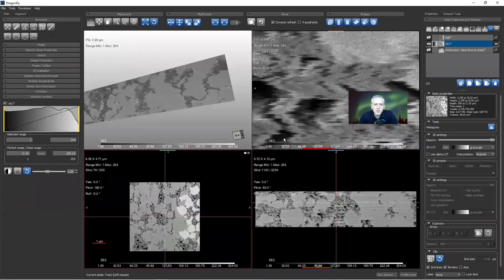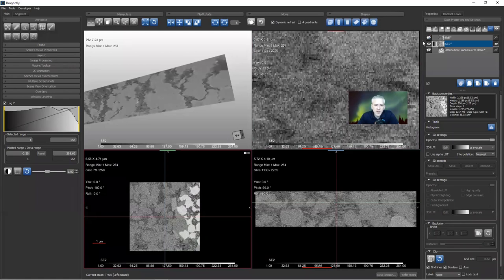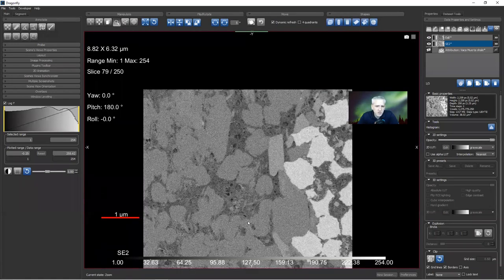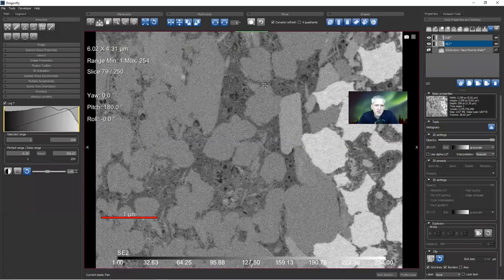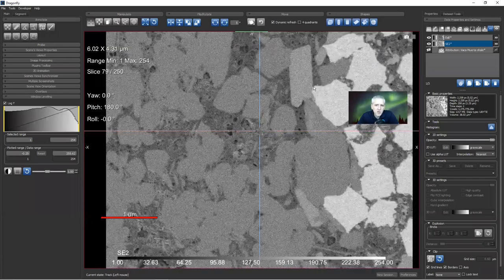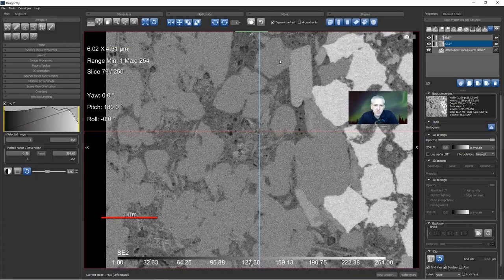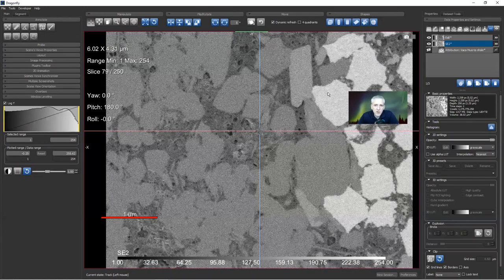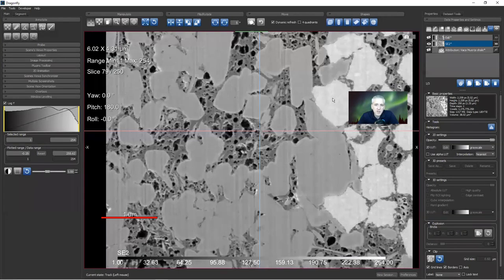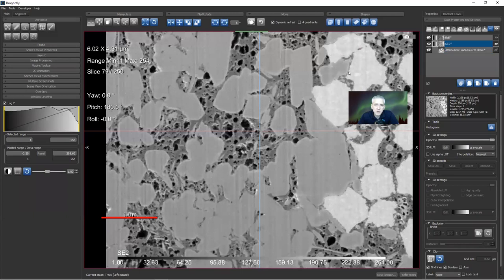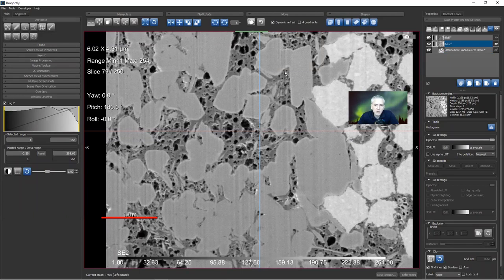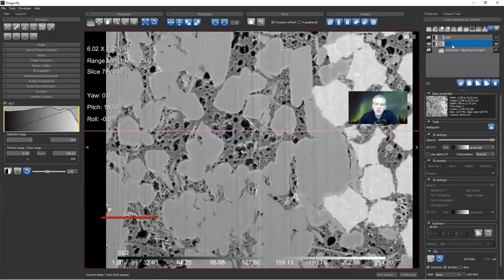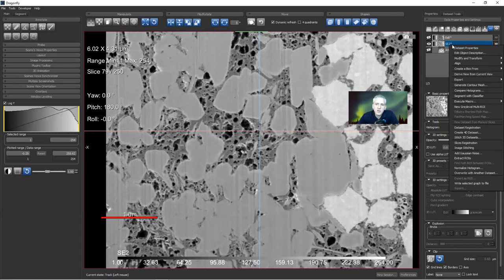I'm in Dragonfly, and I can see this image. If you look at the 3D volume, you may see these kind of jaggy lines from the side. From the side, it looks kind of jaggy. Some of these look kind of jaggy, and that's because in each slice in the stack, the slice is not properly registered. So if it is displaced laterally, then from the side view it'll look like this. If I take this and I scroll through the slices, you can see it sort of moving around. You kind of see it jump up and down and to the left and right. That means these data need to be registered.